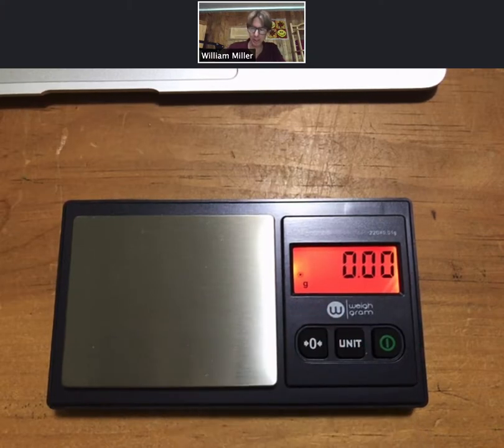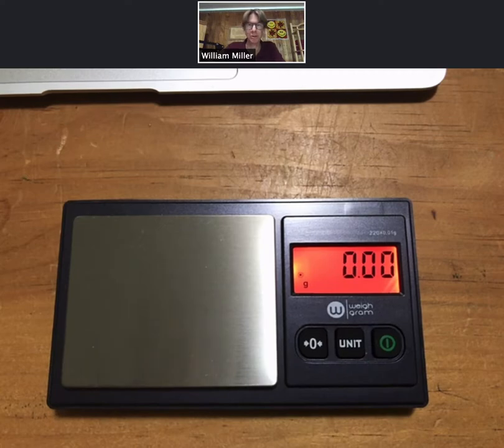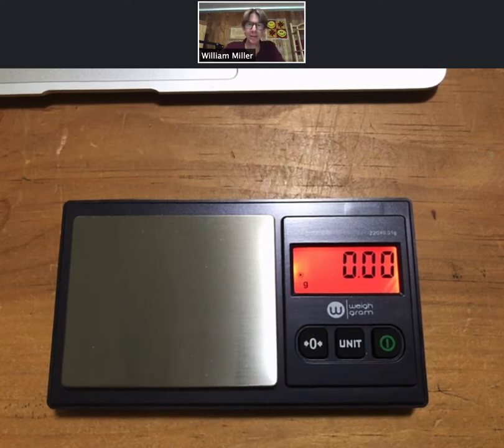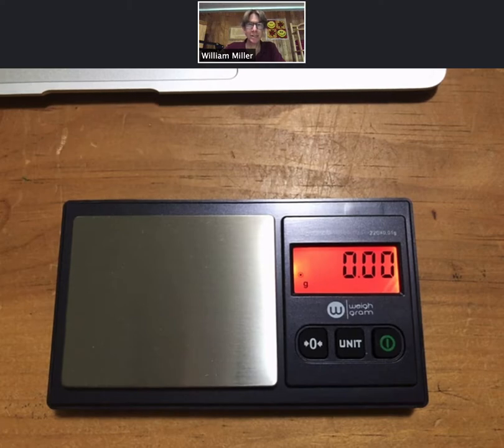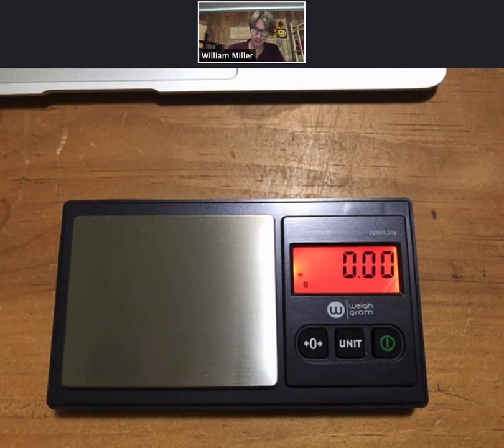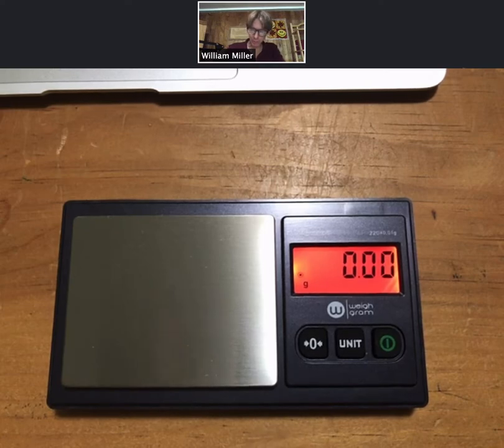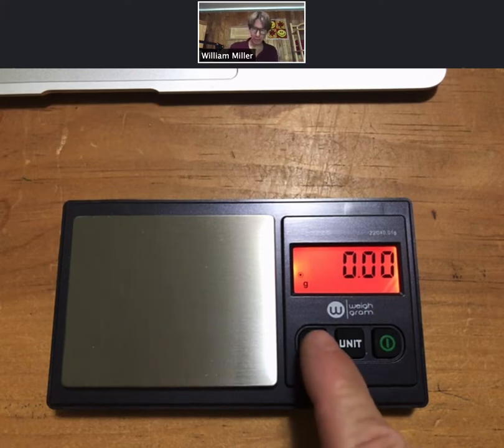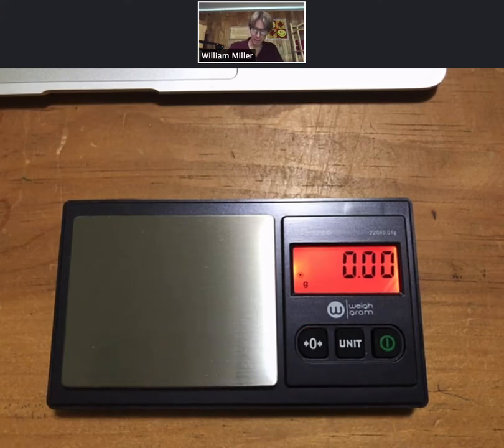You can have different units here, but we will always use grams. This little dot there means that it is stable, it is done measuring, it is ready, you can write down the numbers. So I came up at 0.00.